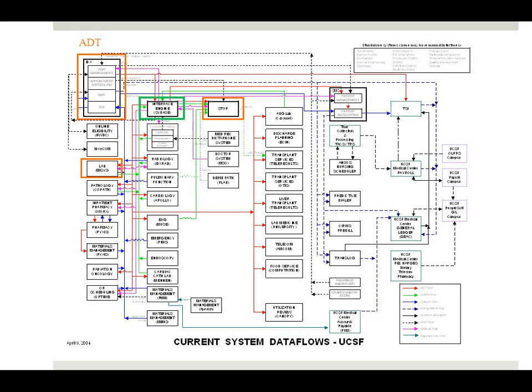Okay. Is that an accurate representation of the pipes? Like if that pipe that connects all the different services together breaks, are they individually connected? They're individually connected to... Actually, Enrique might be able to answer that question better. There's certainly redundancy built into the system so that, like, if a server went down, we can branch around that server and go to a different server. But if the main interface, and there's a single interface between SunQuest and the interface engine, if that goes down, or if there's something a little wonky with the network as a whole, yeah, nothing goes out.